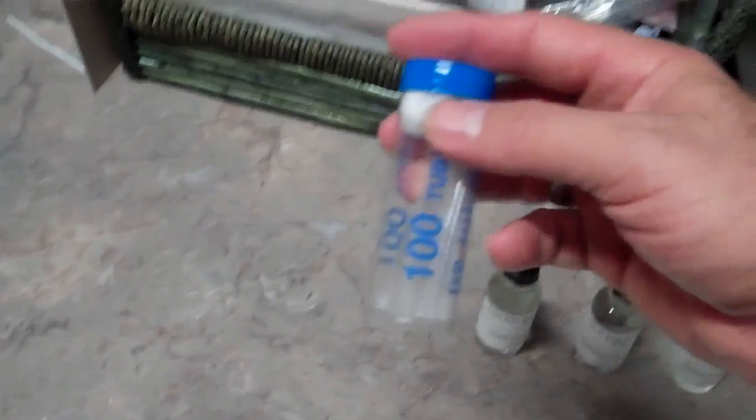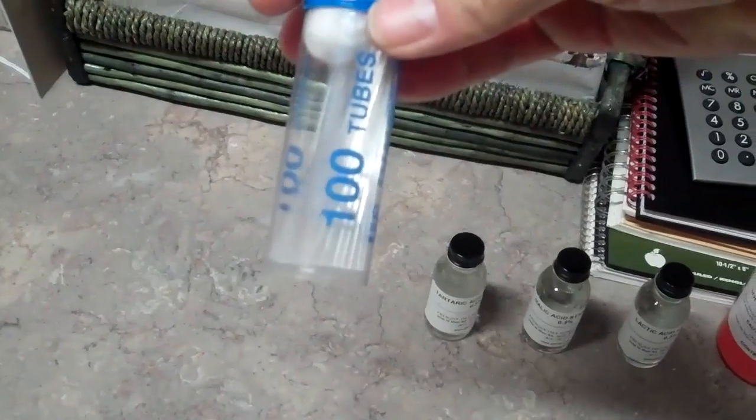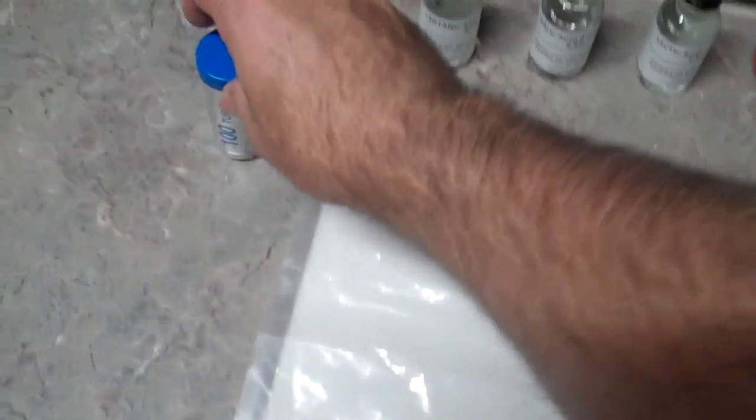Also comes with a hundred of these capillary pipettes that you need for putting the samples on the actual paper.